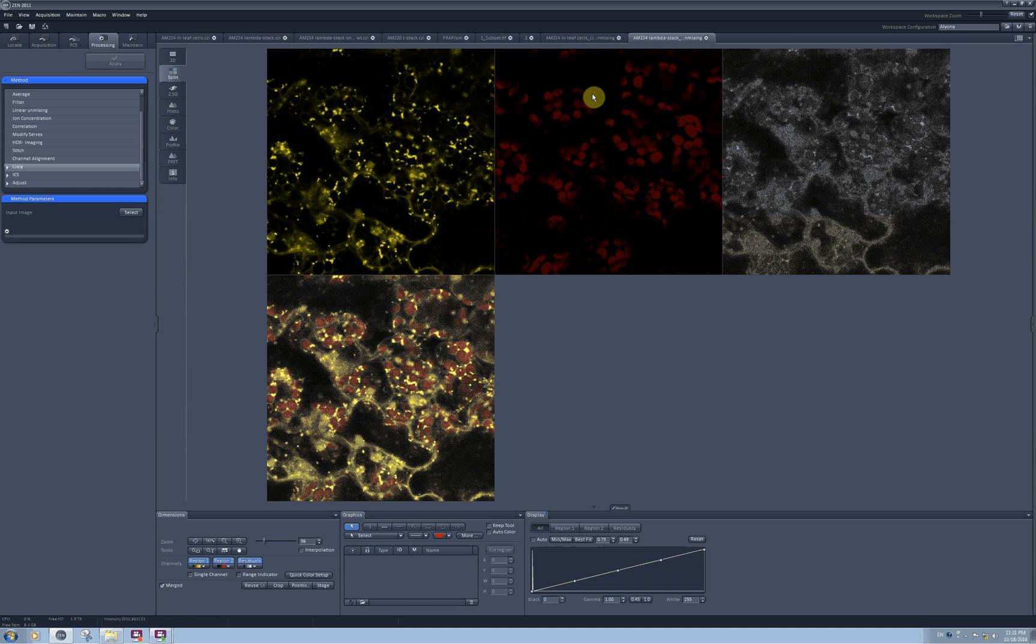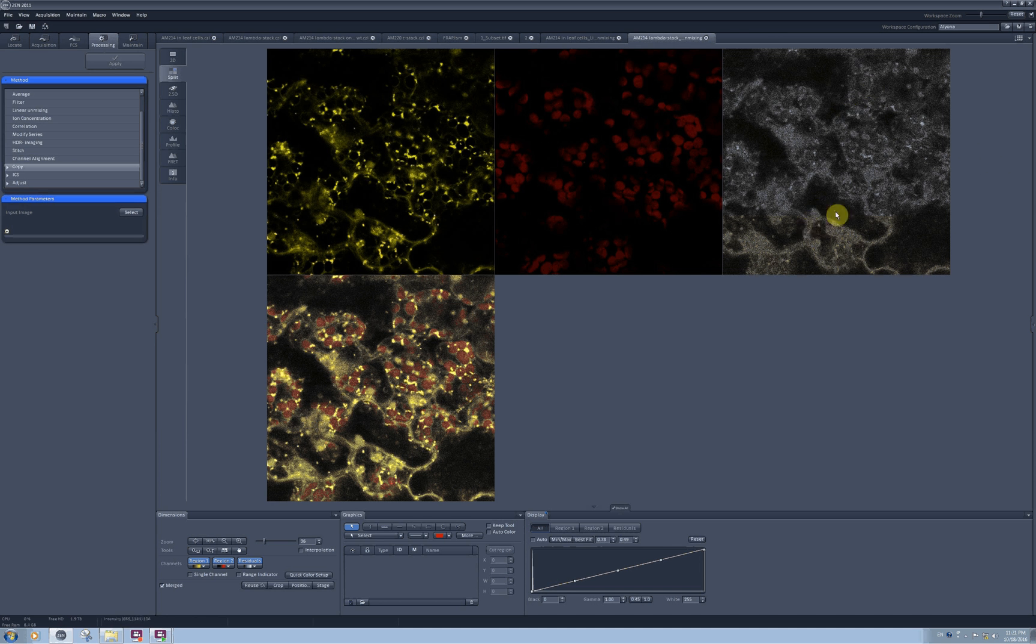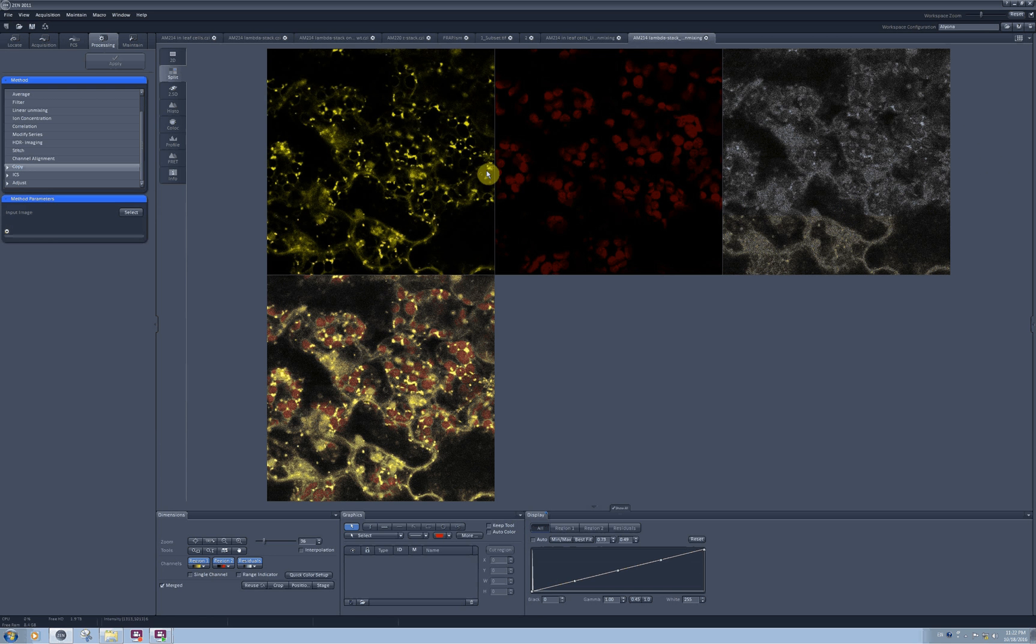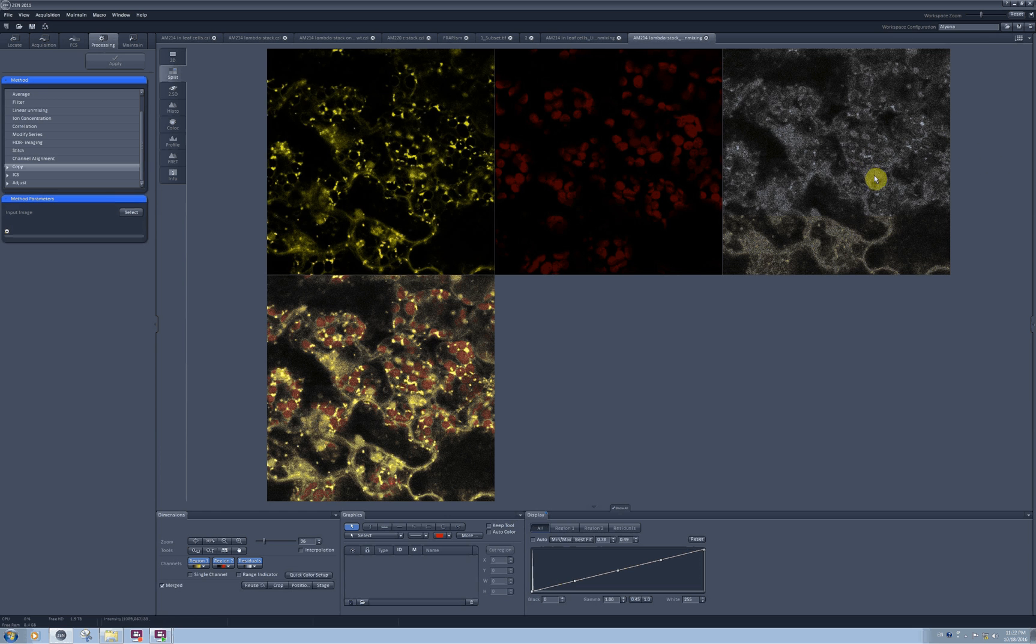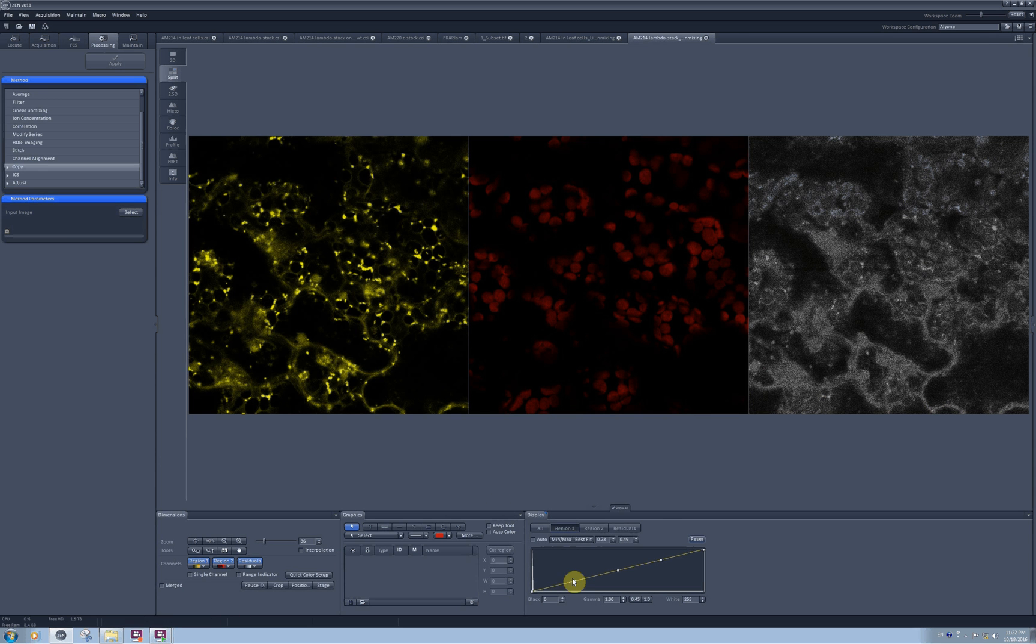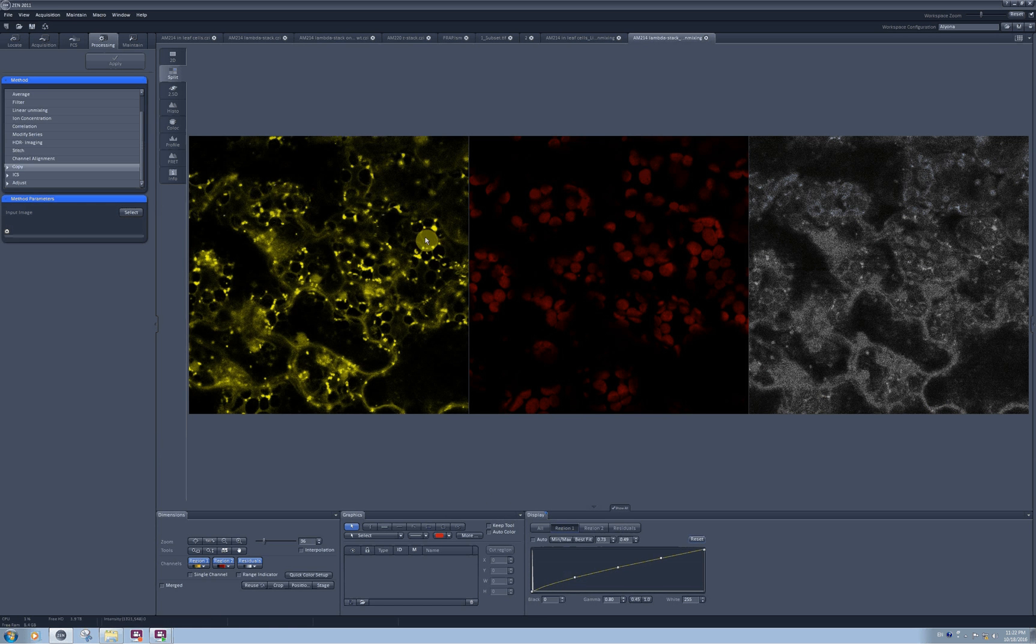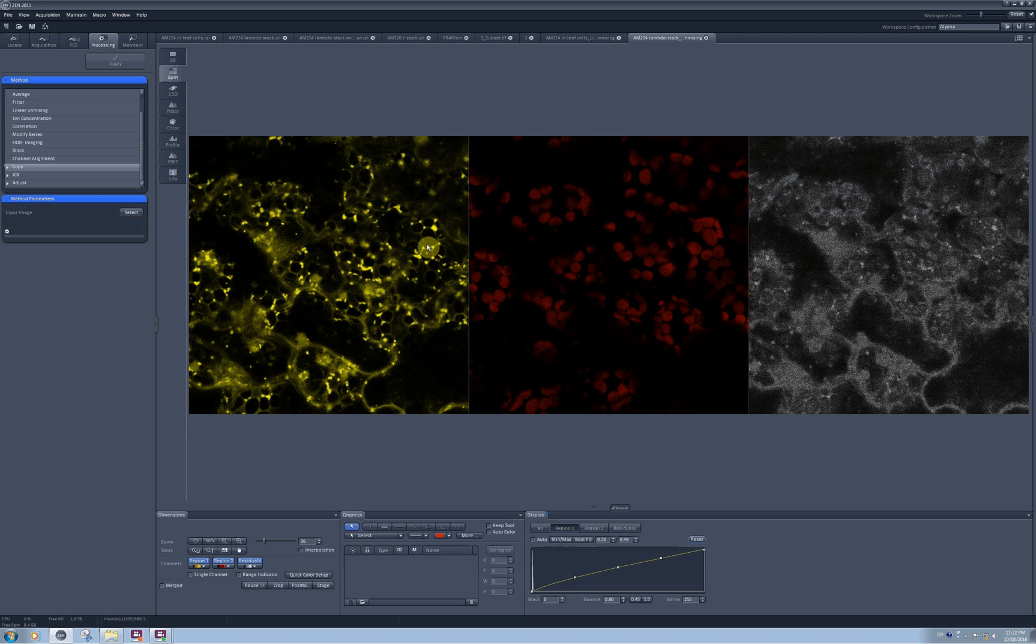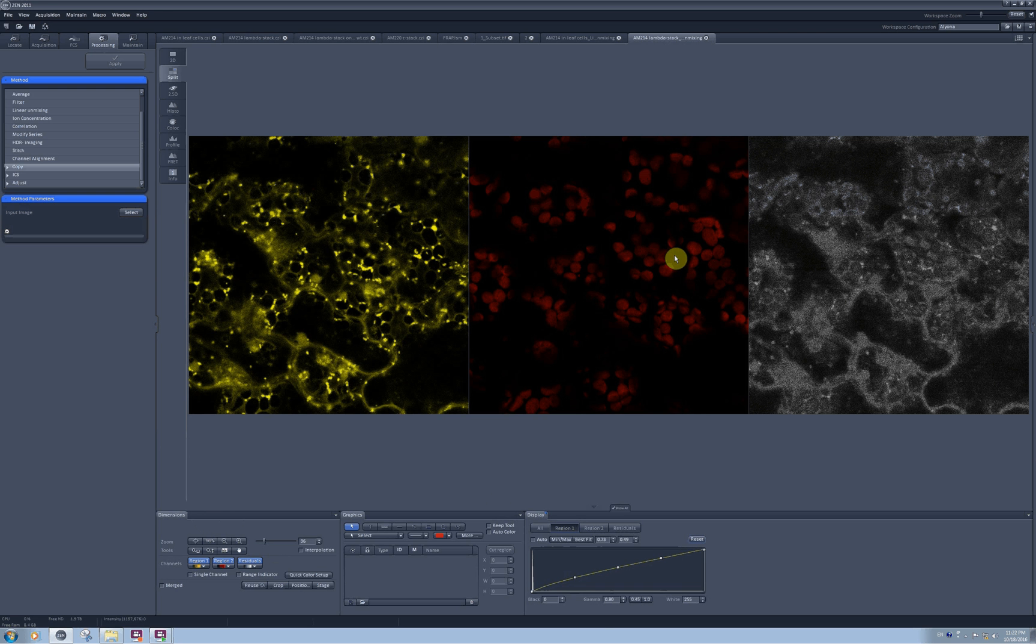And the same is true for the chlorophyll channel. These are the intensities which couldn't be unmixed and annotated as either component 1 or component 2, so they went all to the residual channel. And again, when I pull up the intensities for YFP, I can see that the pixels where only chlorophyll should be present are black in my YFP channel. So the best way to make unmixing is actually to have lambda stack of your image, but it's not always available.